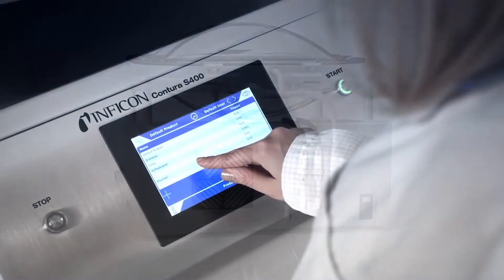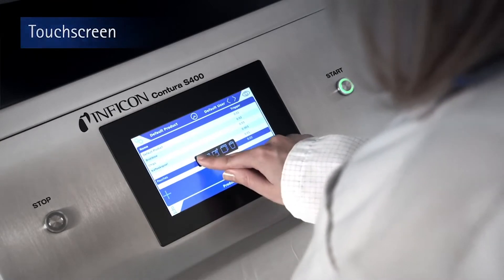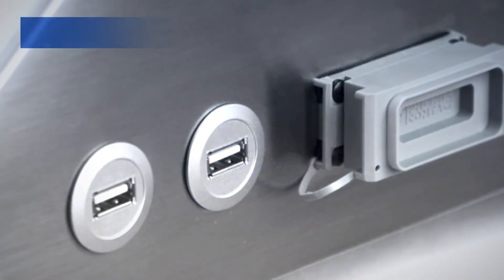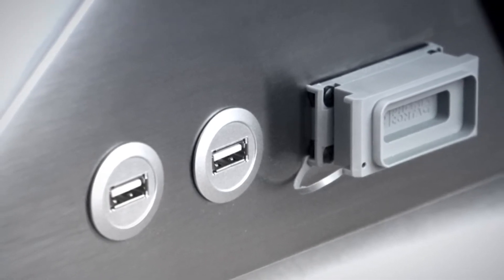The generous 7-inch touchscreen allows you to easily read the test results and enter all the relevant information about the test specimen. The data obtained during the tests can then be transferred to your system using a USB 2.0 connection.